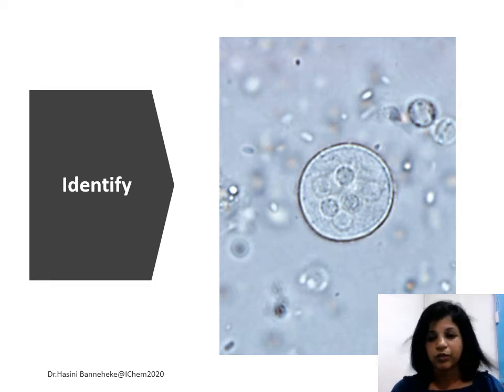One thing you have to look for is the nucleus, the structure of the nucleus, the appearance, and if there is more than one nucleus, how many nuclei there are. And when there are other appendages and other structures apart from the nuclei, you need to look at those as well. So based on all these facts that I told you, you decide on what parasitic species this is.